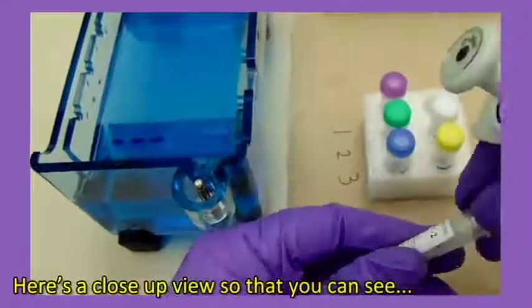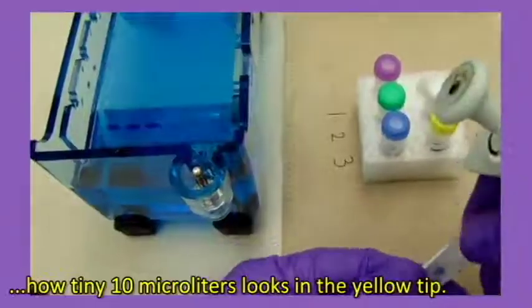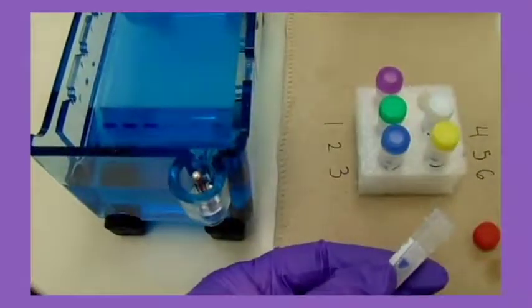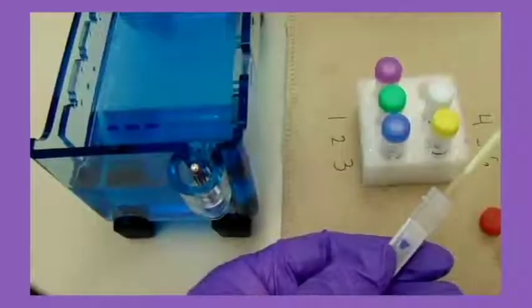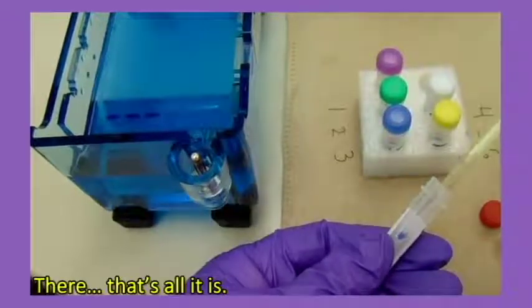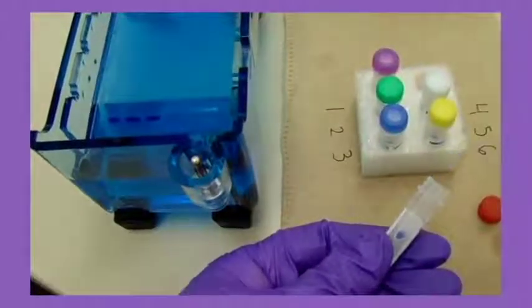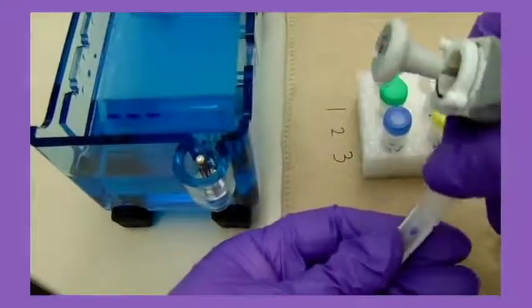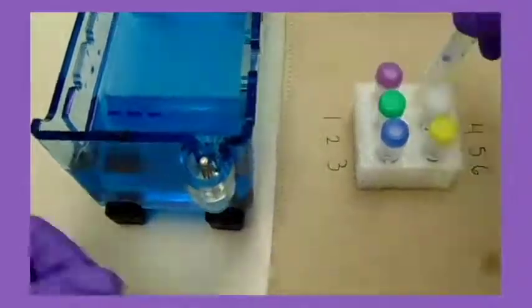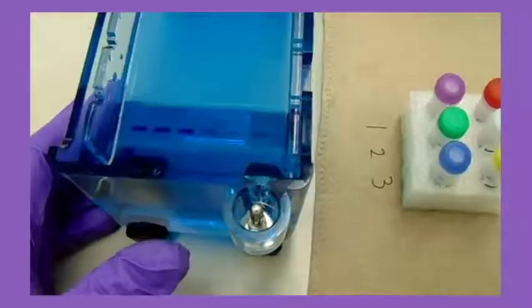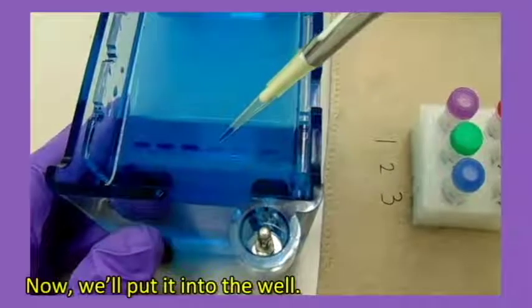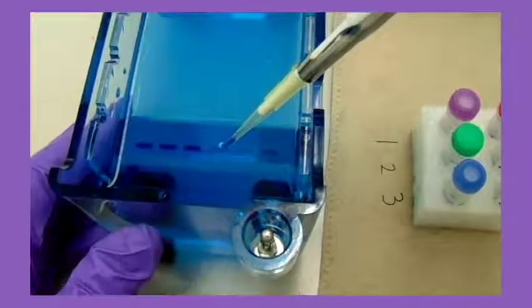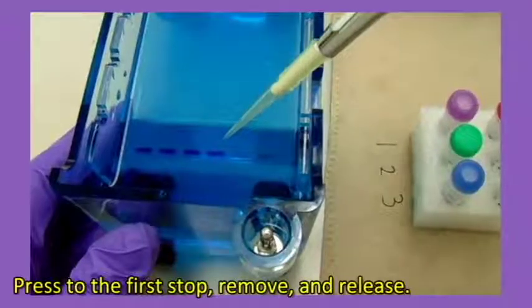Here's a close-up view so that you can see how tiny 10 microliters looks in the yellow tip. There, that's all it is. Now we'll put it into the well. Press to the first stop, remove and release.